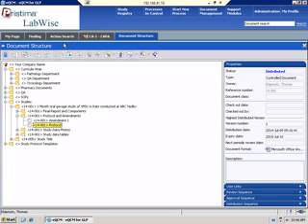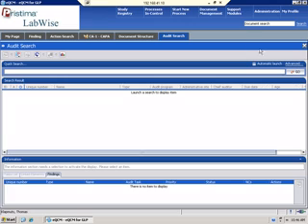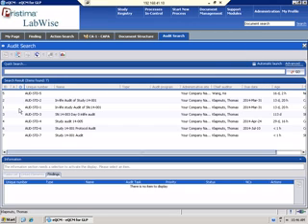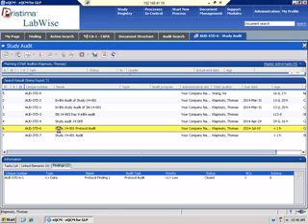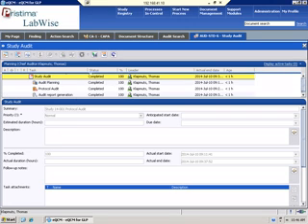The final step of the audit is actually generating the audit report. So if we come back in and we look at our audit, we have the plan which was done, the protocol audit, and then the report generation.